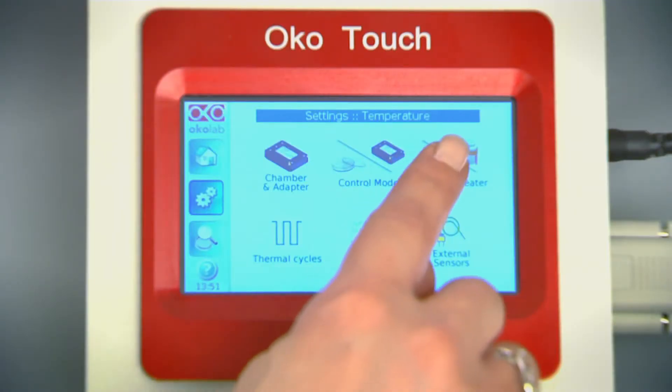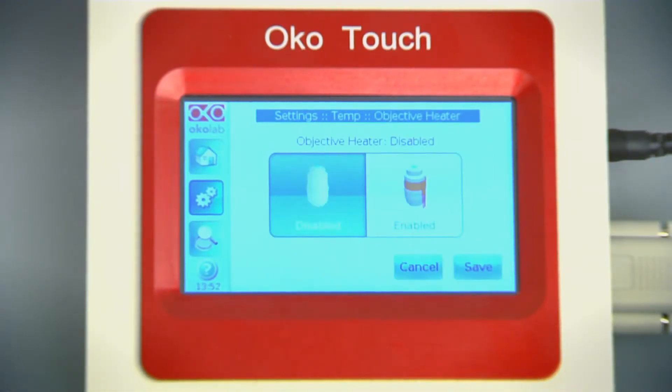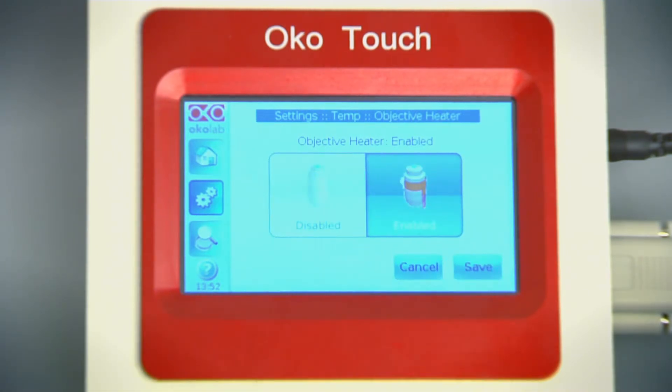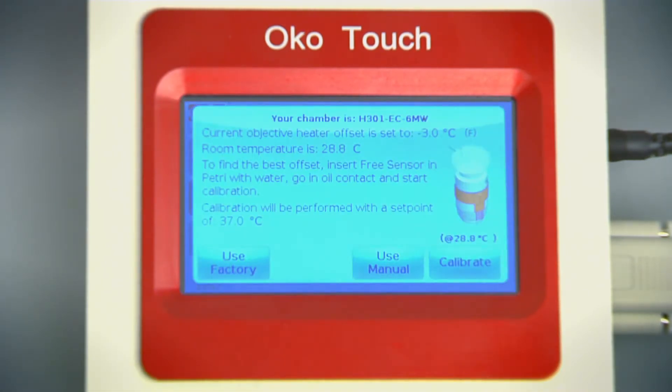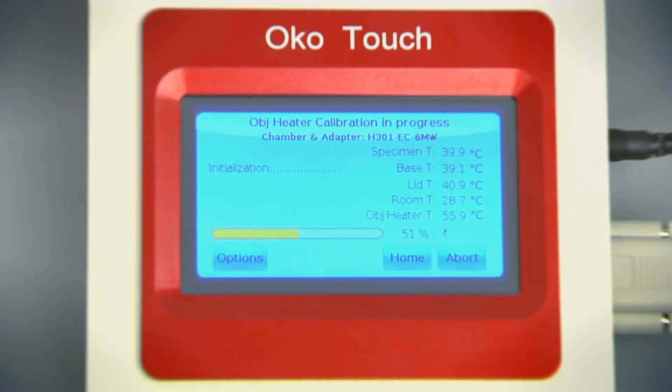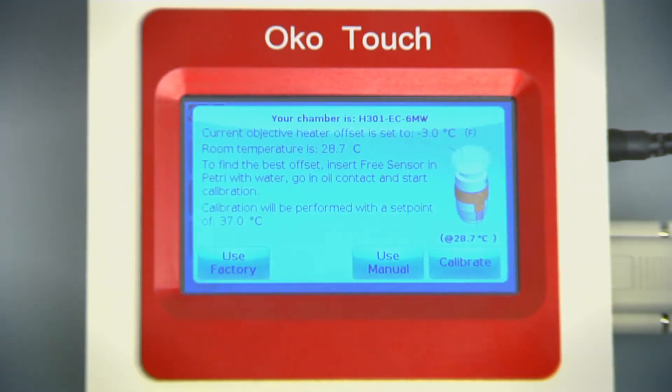Calibrating the objective heater could not be easier. The automatic routine modifies the settings of the objective heater until the desired temperature is obtained inside the reference well. Calibration data can be stored as a function of room temperature and recalled at need.